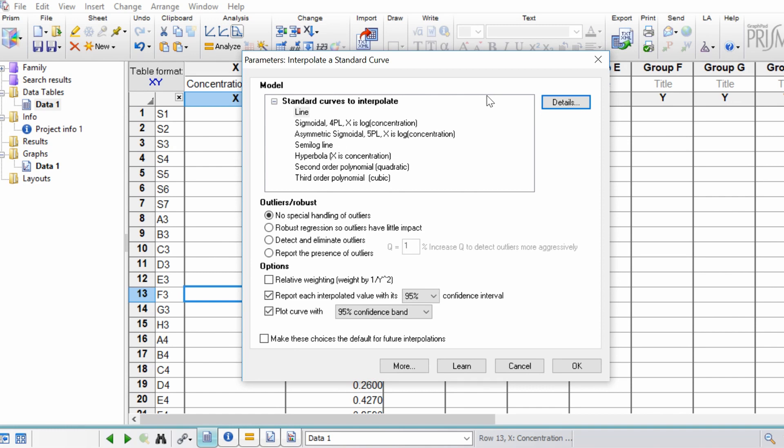So what is the relationship between the known concentrations and the absorbance values for your standard curve? For example, is it a straight line or is it something that requires a sigmoidal curve?